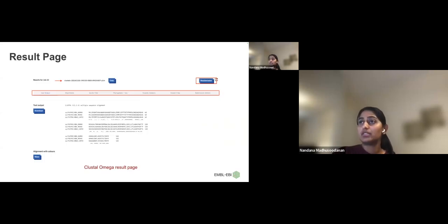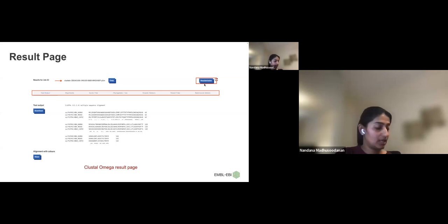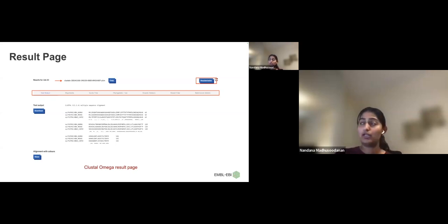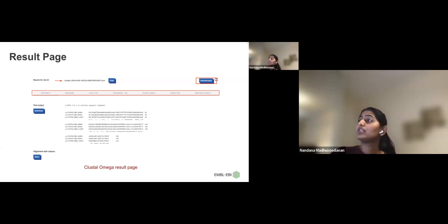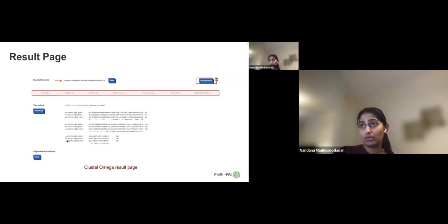This is an example Clustal Omega result page. You can see the job ID and different result tabs. We recently added a resubmission feature, which is especially useful for training purposes — if you changed default parameters and want to run the analysis with a different input sequence, you can click resubmit and it will preserve the parameter values so you just need to change the sequence and re-run.